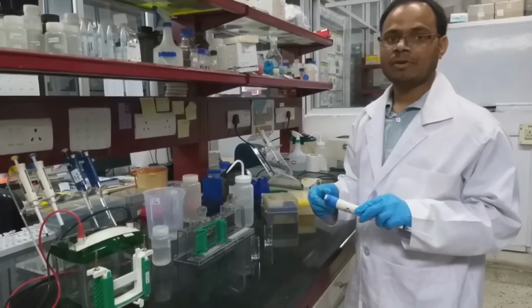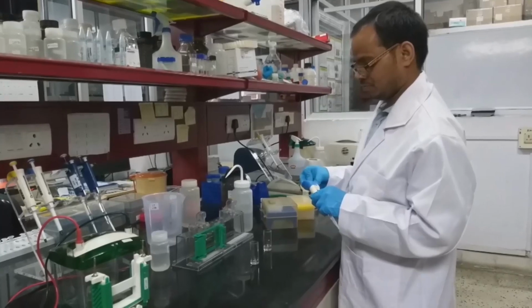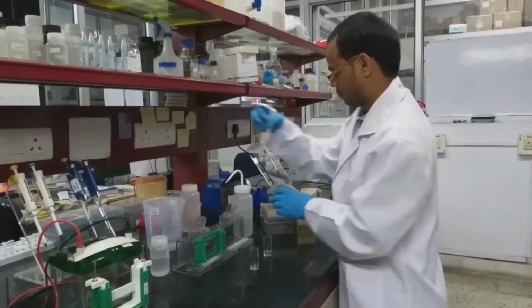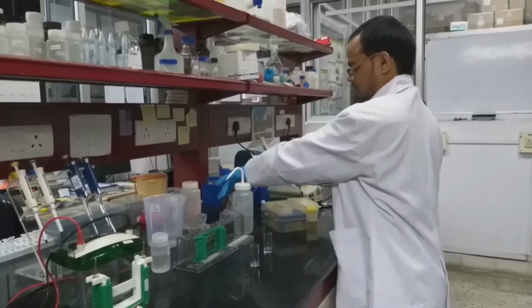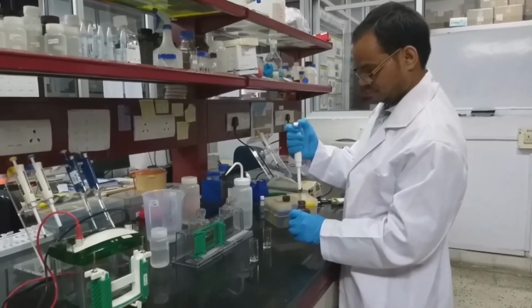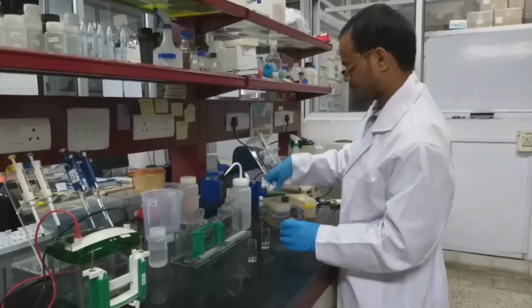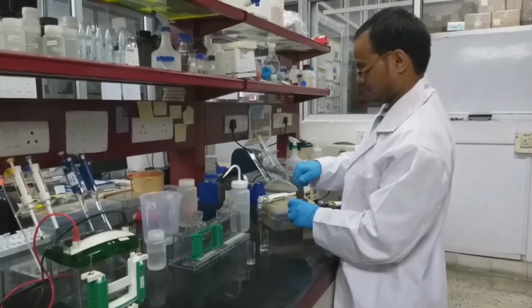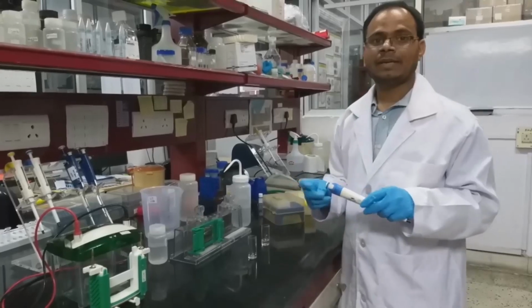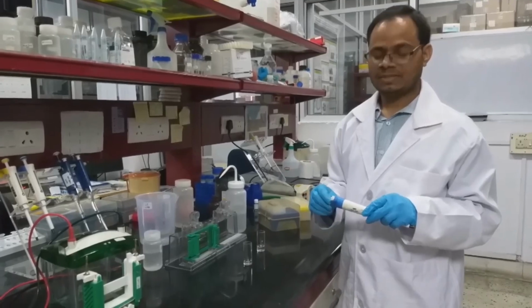Next, 830 microliter of acrylamide. Then 630 microliter of Tris HCl pH 6.8.